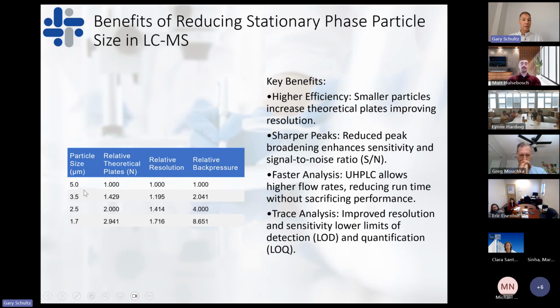So historically, particles were typically in the 5-micron size. By going now to these smaller particles, we can increase the separation efficiency by about a factor of 3. What that means is that you can achieve the same separation in one-third the time that it traditionally took. The challenge there is that you require about a 9-fold improvement in pressure performance, and that's what the latest technology has achieved over the past 10 years.